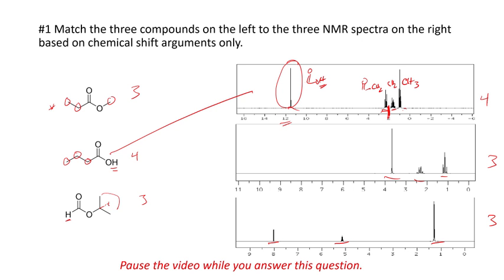What's the big difference? Well, on the spectrum, this is huge. This peak over here at 8. There's absolutely nothing that this could be other than this H that's on the carbonyl group of our aldehyde. That's where those come. So this is huge, and it completely nails it, and it solves the problem. There, we're done.